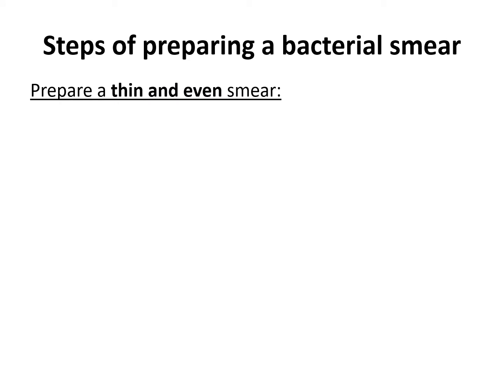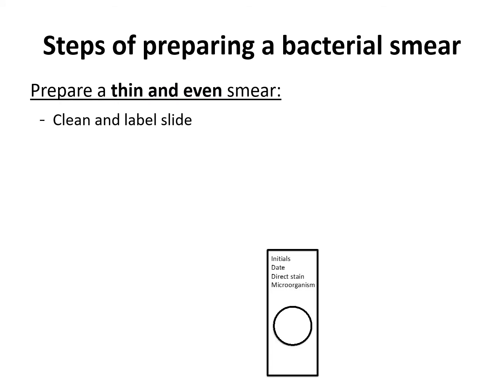So to prepare a thin and even smear, first thing is you want to grab your slide, of course, and you want to make sure that you clean it. So how do we clean a slide? We usually wash it with water and soap, and the reason why we do that is because you don't want to have any dirt or fingerprints or oil on your slide, okay? So you don't want your slide to have fingerprints or dirt on it.